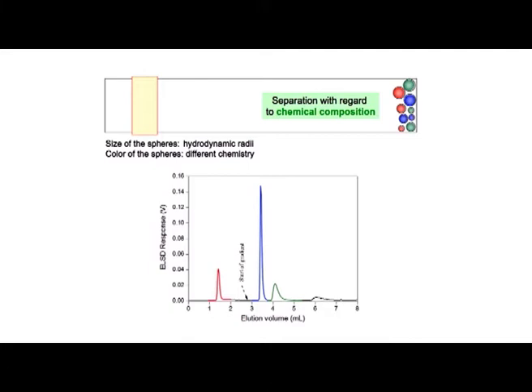It is separated from the other component that is in green color. So, we got the separation, efficient and fast separation. As you can see from the time scale, it takes only a few minutes to separate the individual components. These are the most widely used, because nowadays many analytical labs, research labs and industries are using them, because as I told you, even though the instrumental setup is quite costly, this is very fast and efficient.